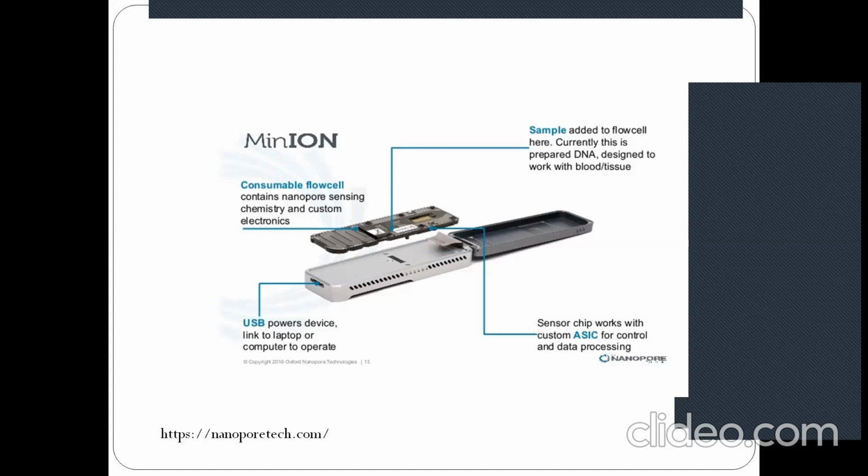Base calling concerns the bases in the sequence you have got, maybe A, T, G, C, C, A. There is dedicated statistics behind the data curation: if this is a G during the real time acquisition, base calling gives you an accurate idea of the probability of the G, whether it is 25%, 40%, more than 60%, or more than 75%.